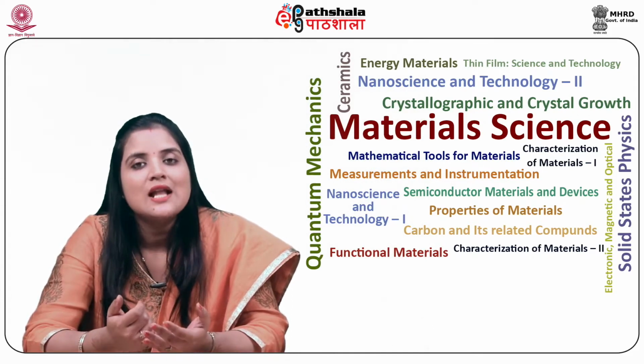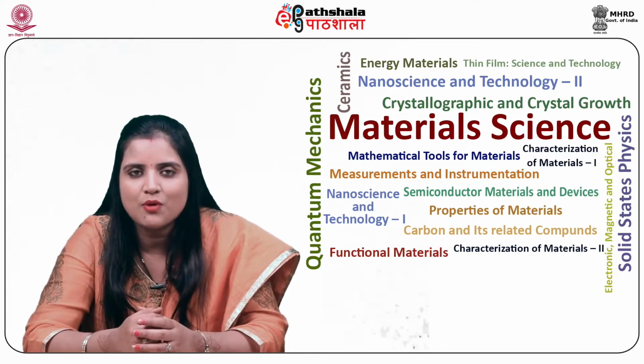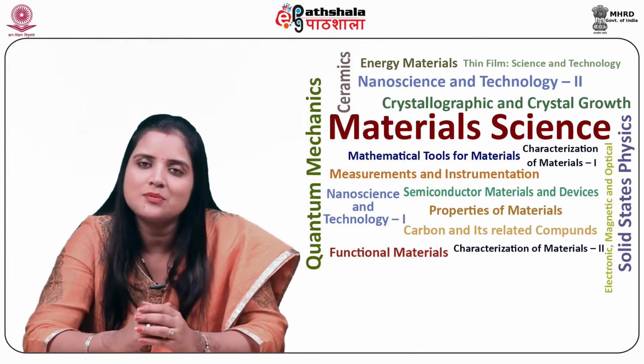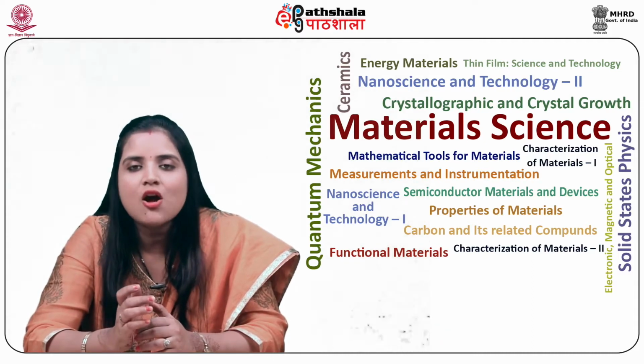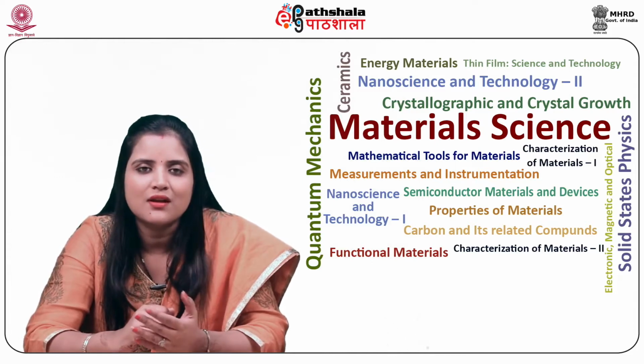So students, let us now summarize what we have learned in this module. Firstly, the basic analysis principle of EDS was studied. Secondly, the principle of characteristic X-ray generation was discussed.